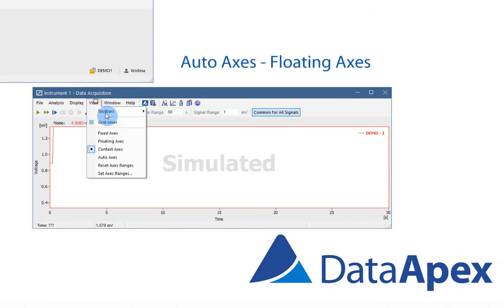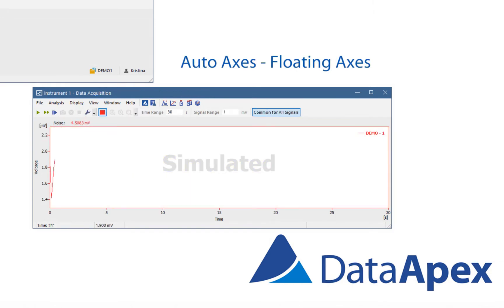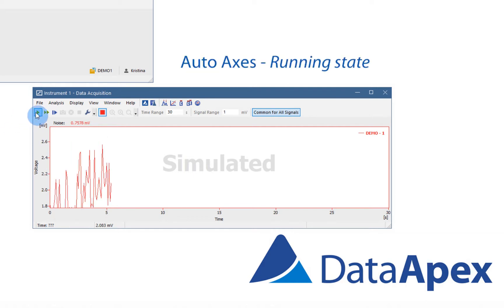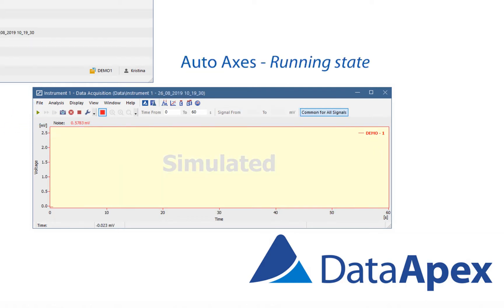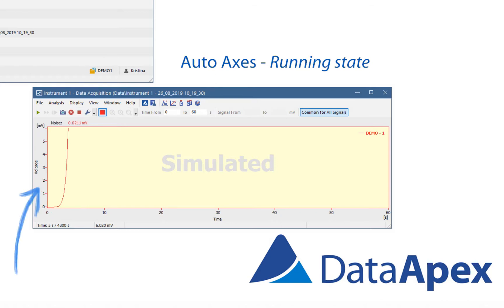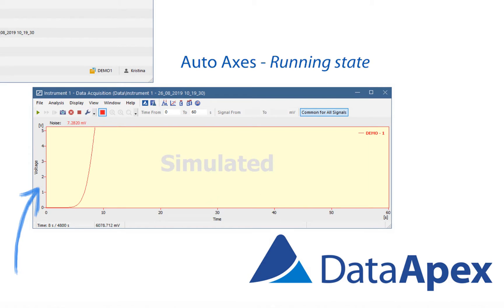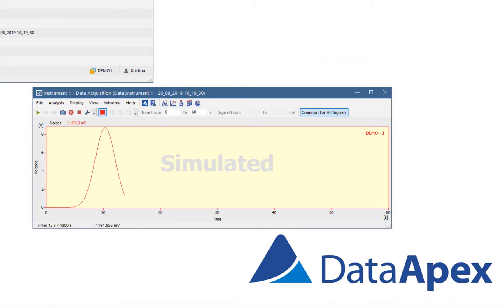Auto axis is similar to context axis. It means it uses floating axis when the instrument isn't running. But in running state, the range of the signal axis starts at the minimum value and enlarges according to the curves of the signal, thus the signal always fits in. Time range can be changed in the toolbar.